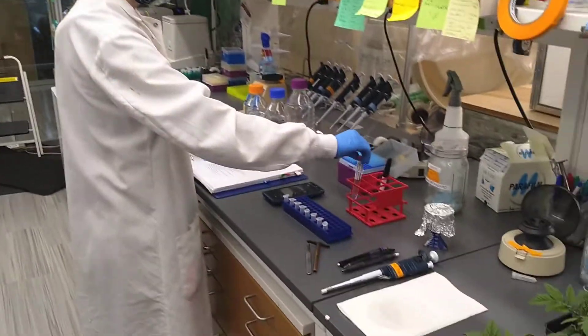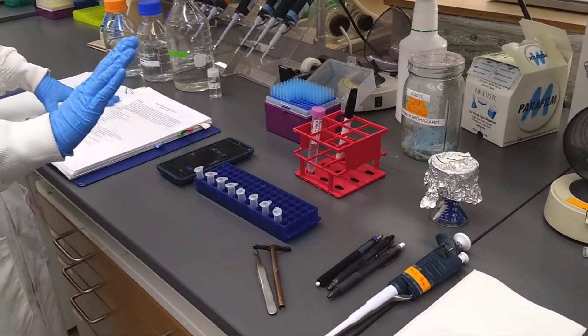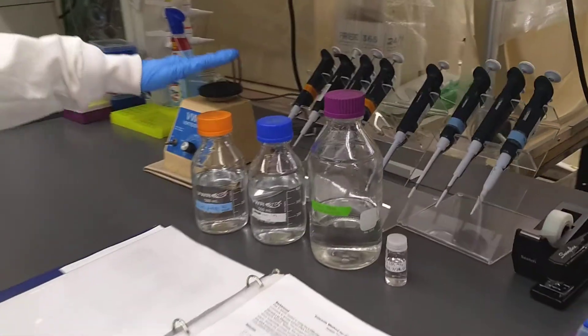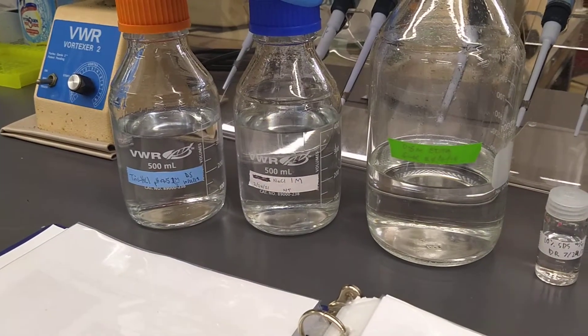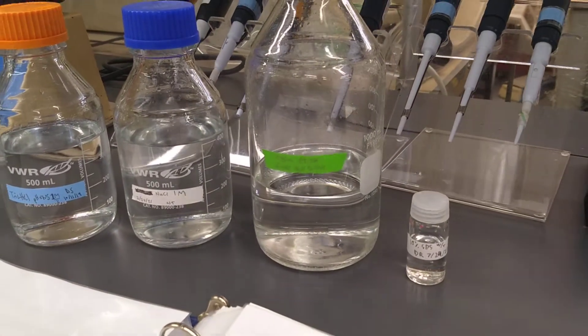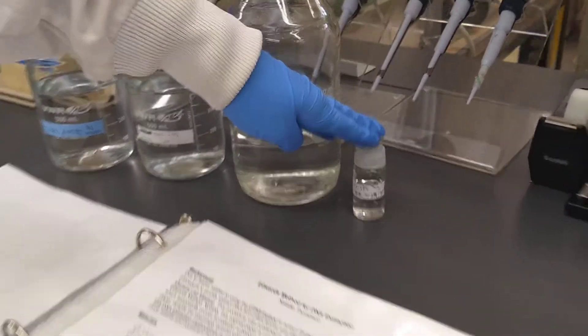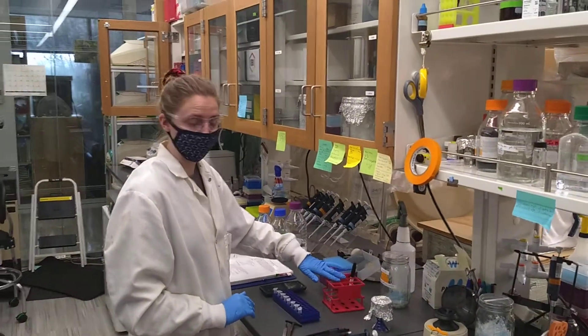I've already made up my buffer, but we recommend that you make up your Edwards extraction buffer fresh every time. It only needs four ingredients: a pH buffer, a salt to keep the ionic strength and the solution perfect, a chelating agent, and a surfactant. Every time you make this, you should make up this buffer fresh.